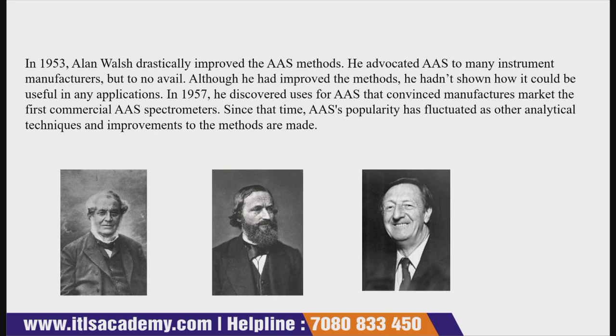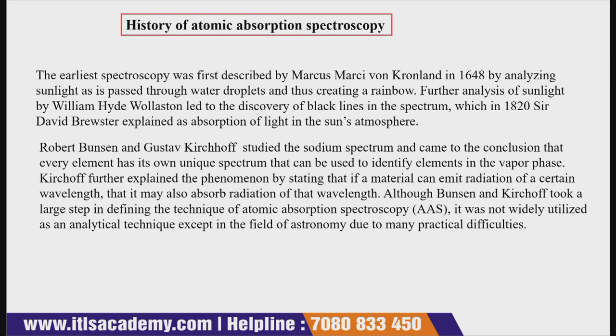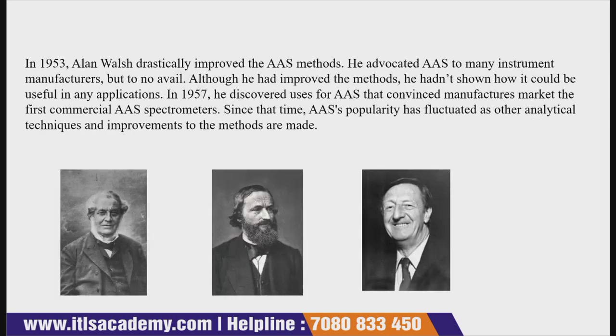So since that time, atomic absorption spectroscopy's popularity has fluctuated as other analytical techniques and improvements to the method were made. So this is the history behind atomic absorption spectroscopy. The history took shape first with Marcus, William and David, then later Robert Bunsen and Gustav Kirchhoff, and later on Alan Walsh was the person who improved the AAS method.